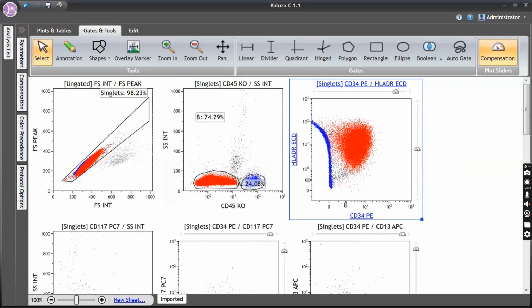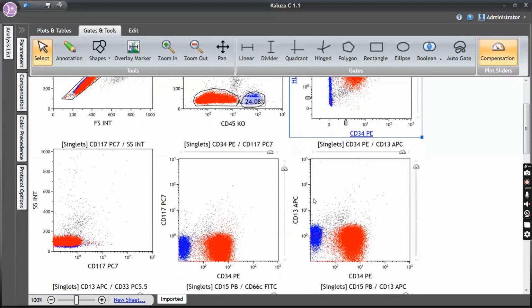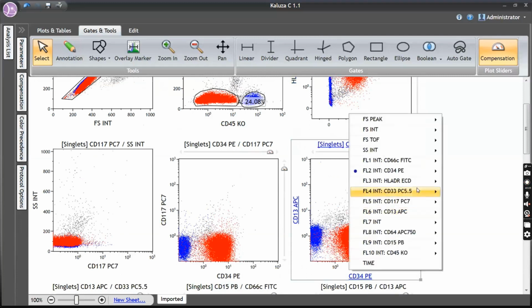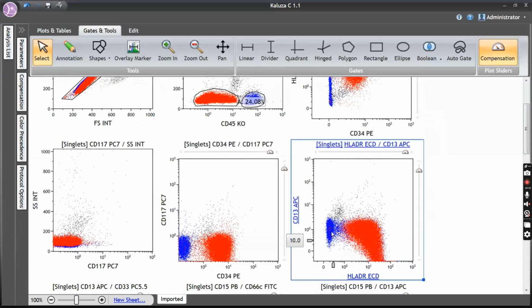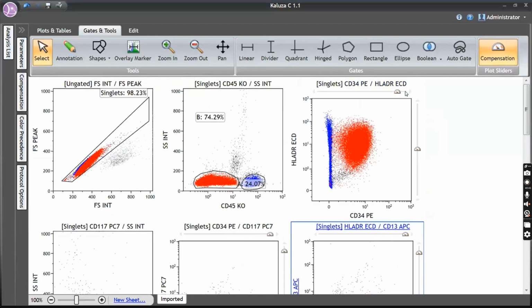See, this is compensation error. You always see it anyway. You see the population is skewed like this. When you find these things, this is compensation. I wantedly took some cases which show this compensation error so that I can explain this post-acquisition compensation. Now again, this is compensation. You see this, it's going like an arrow with a pointed end. When you find something like this, it is compensation. Now you need to adjust it. Now it is adequately compensated.